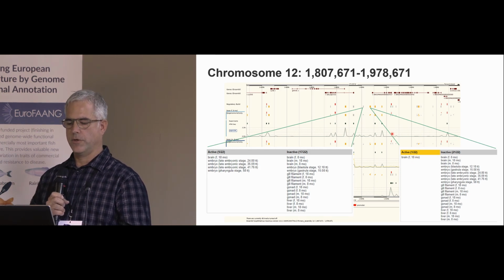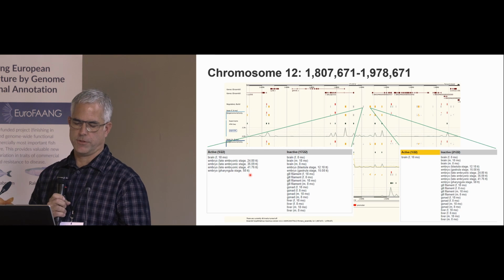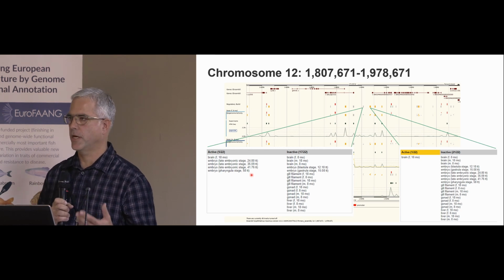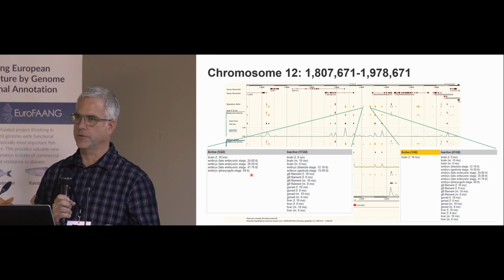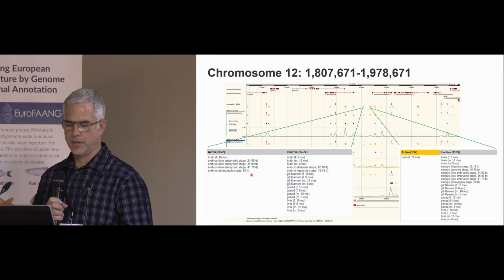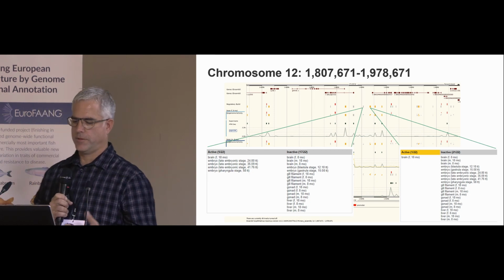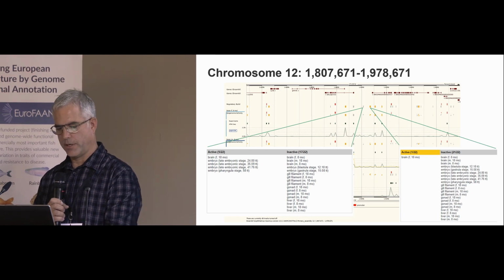This one here, open chromatin, is the same idea with brain. Perhaps there's some signal here, but I also just want to show it comes out with late-stage embryo, which is again quite nicely suggestive that perhaps it occurs in the late stage of the embryo in terms of brain development potentially. So here are some of the things you can already do with fairly simple analysis with the annotation.